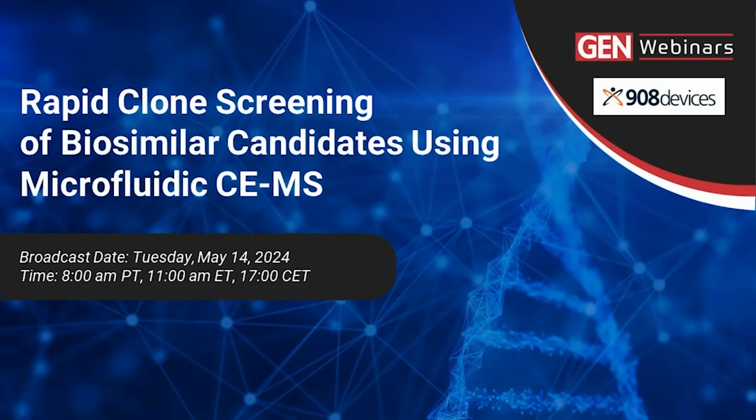Now, an alternative approach for assessing charge heterogeneity is microfluidic capillary electrophoresis coupled to mass spectrometry, or CEMS. The microfluidic CE technology boasts low sample consumption and short analysis times, while the hyphenation to MS enables identification of the charge variants and the glycosylation profile of the native protein.